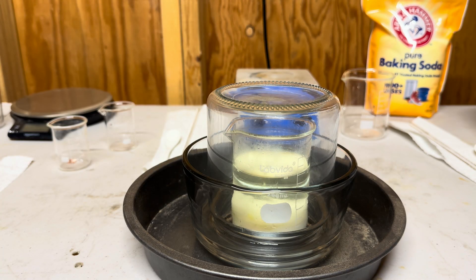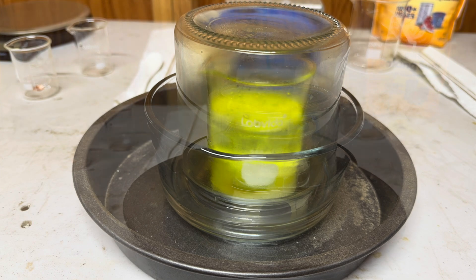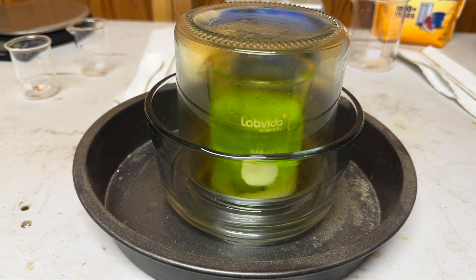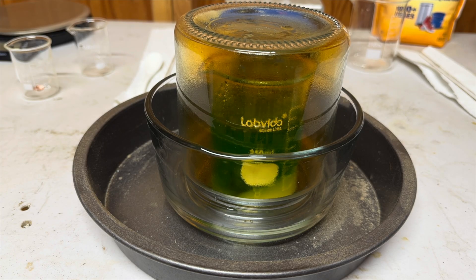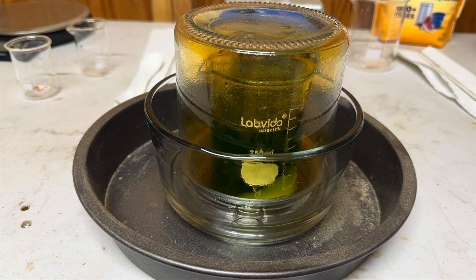The copper reacts with the hydrochloric acid and the nitrate mixture to generate nitrogen dioxide gas that flows out and is forced into the water mixture, dissolves, and produces nitric acid. It's not very efficient but it works.